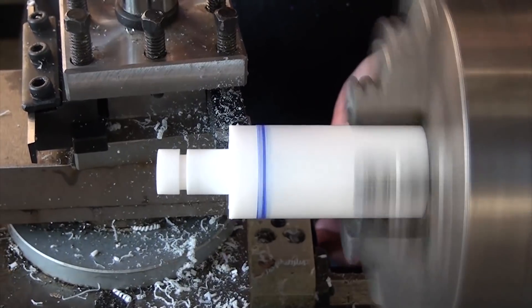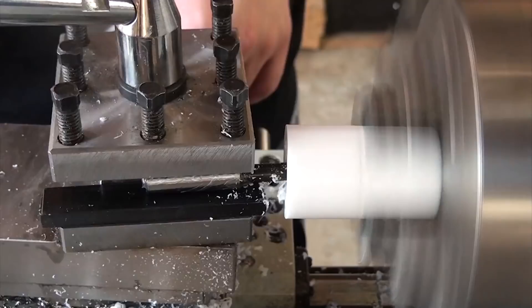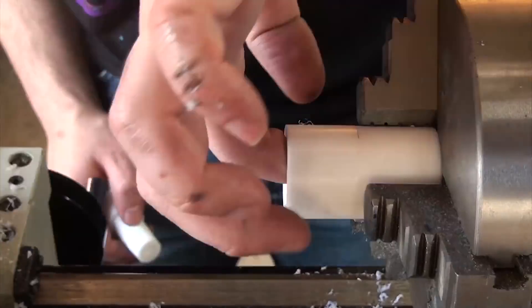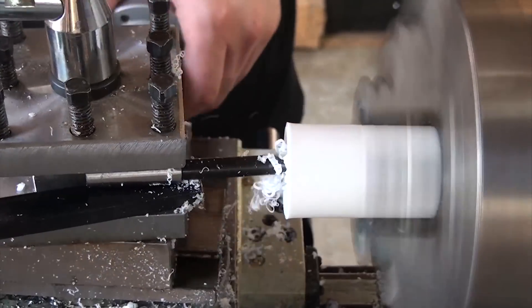Once that was done, the end was drilled out and tidied up before the part was turned around. To make the cone required that I first drill out the center to make room for the boring bar, and then resetting the compound to be tipped 2.5 degrees in the other direction. After that, cutting this was really easy. Once I knew the fit was good, I could take a couple of clean-up cuts and this part was complete.